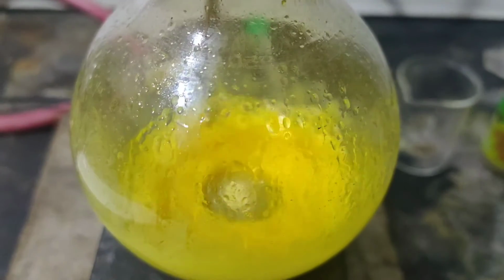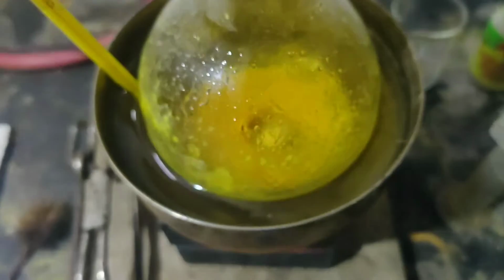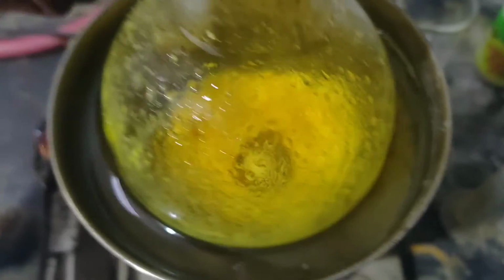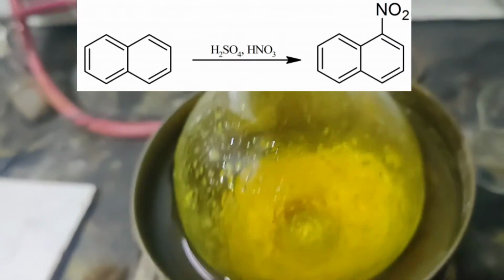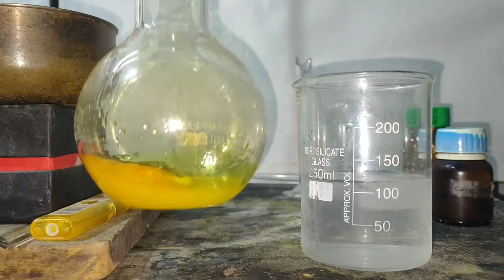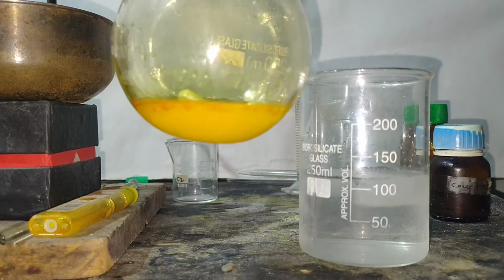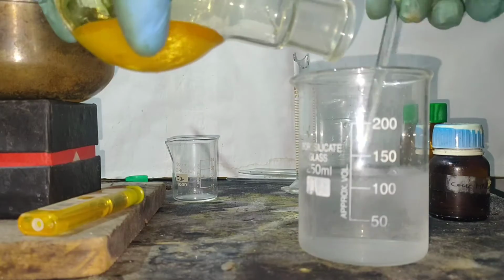After all the nitrating mixture had been added, the flask was placed on a water bath and heated to 60 degrees Celsius for 1 hour. The naphthalene is now getting nitrated at the alpha position, that is the first position. There wasn't any formation of tar and the reaction mixture was yellow colored.